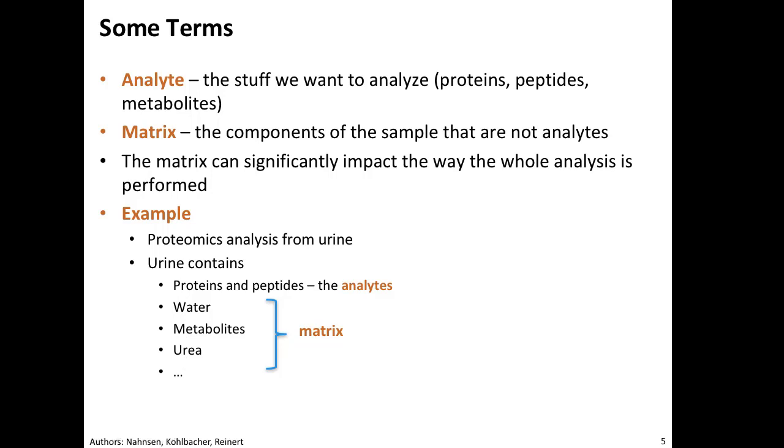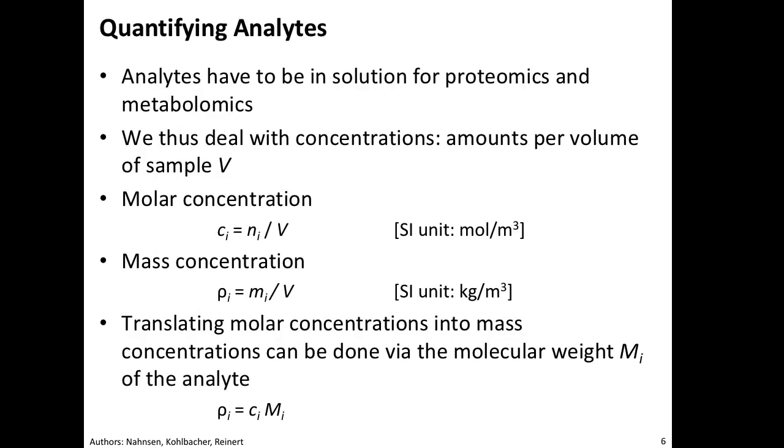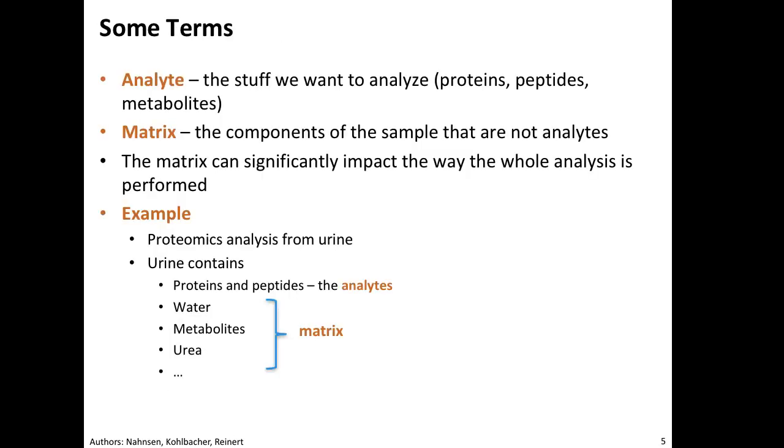If we want to quantify these analytes, then usually in proteomics, metabolomics, we're dealing with analytes that are already dissolved. They're in solution, and that is why by amount we usually mean something like the concentration. We usually deal with fixed volumes, yes? So it depends on your perspective.